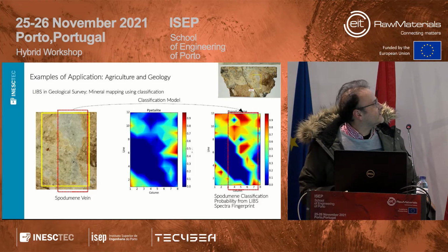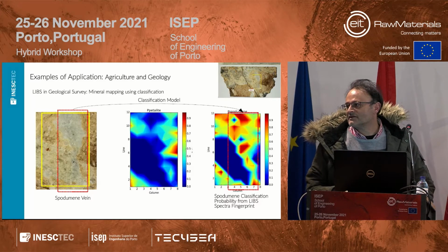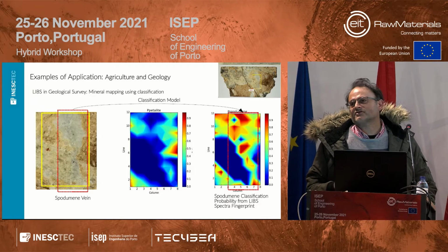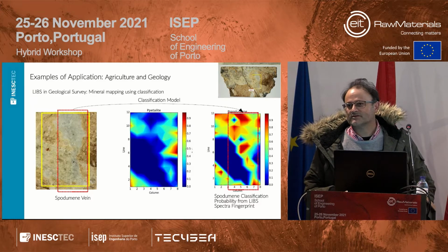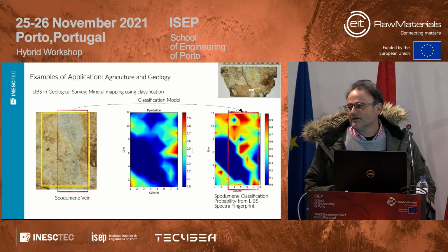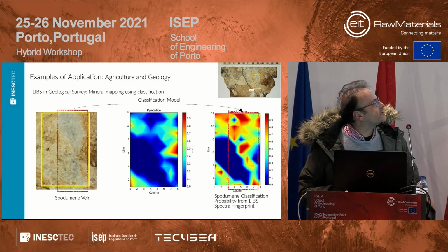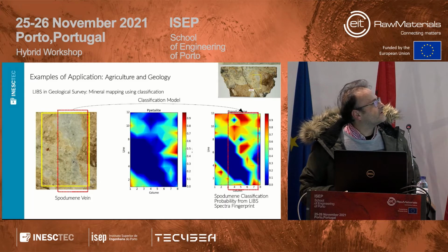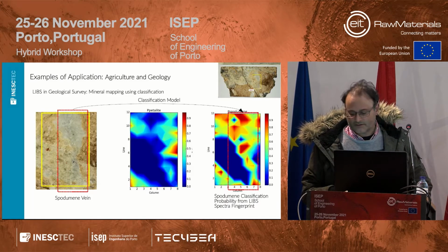So this means that the end result or the end signal of LIBS has some kind of structural information from the initial breakdown. And this is really relevant for geology because not only you are quantifying the element, but you are trying to classify in real time the type of mineral that you're looking at.